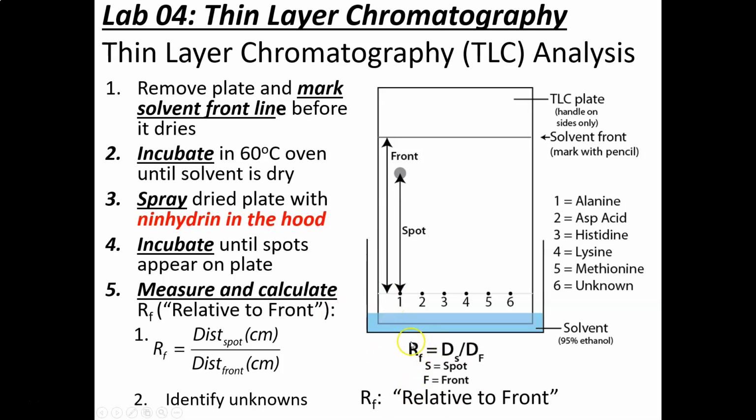A couple things about RF. It doesn't matter if you use centimeters, millimeters, inches, whatever, right? The units are going to cancel each other out. So RF is a unitless value. And kind of note this.